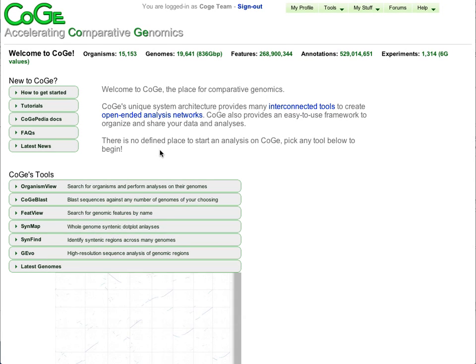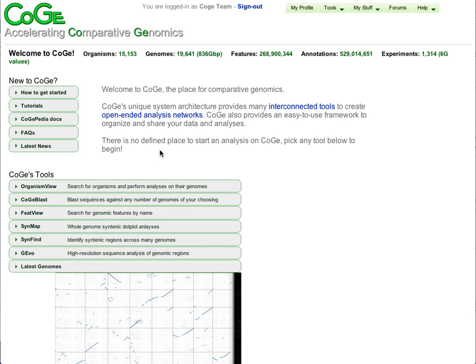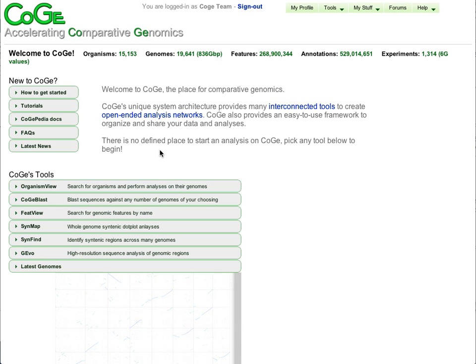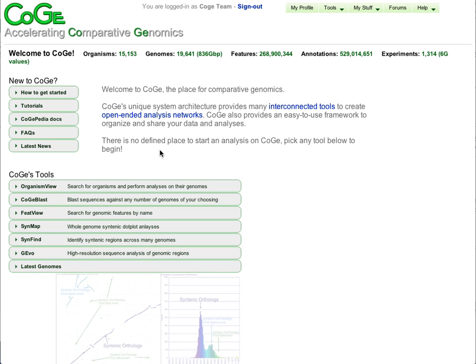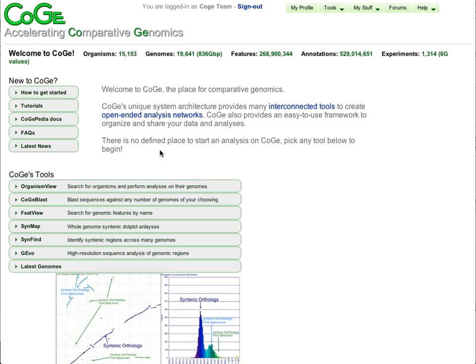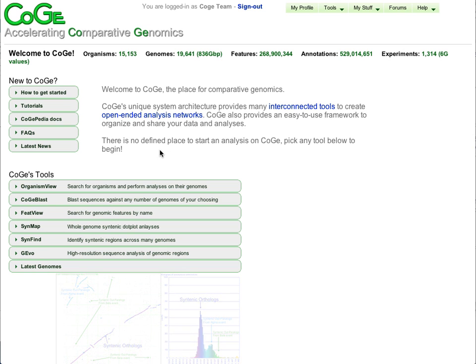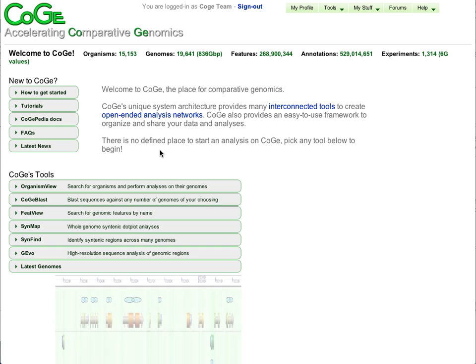Hi, this is Eric Lyons, and this tutorial is designed to show some of the major features of CoGe. CoGe is a scalable web-based platform designed to make the management, integration, analysis, and visualization of genomic and functional genomic data as easy as possible for a variety of different types of researchers.